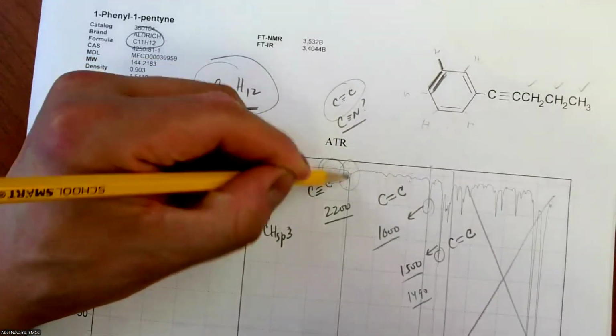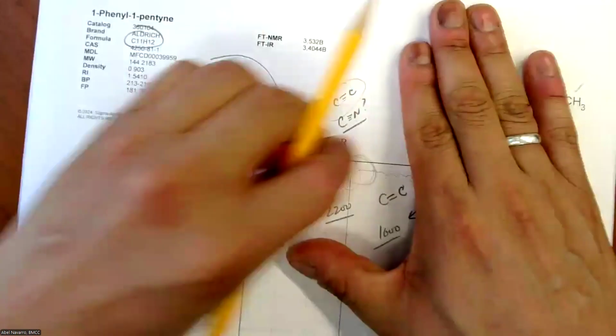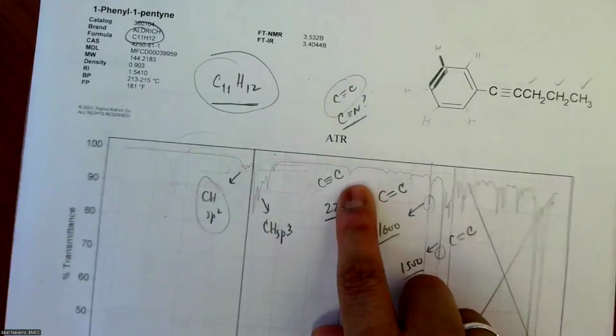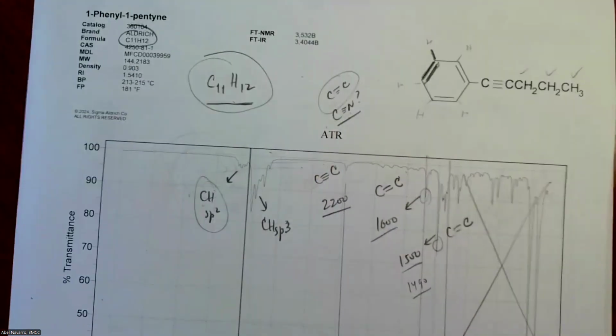So first go by the wave number. Nitriles are normally in this part. Alkynes are on this part. They're very close, but not necessarily. Sometimes, once again, the wave numbers are preferential, so they don't have to be that accurate. But that's definitely a C-triple-C because of the formula, C11H12.